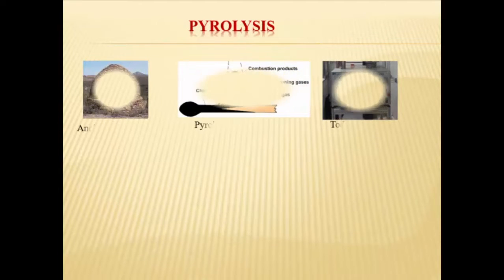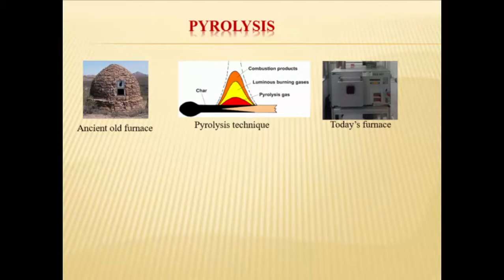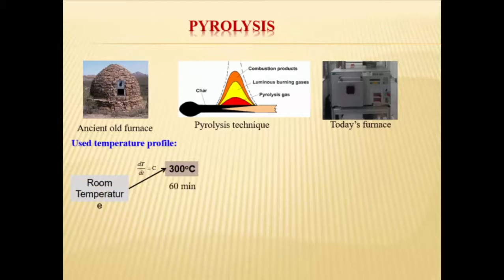Now this pyrolysis process is not new. It comes from the very ancient age, and people have used this kind of furnace to make charcoal and all these things. And nowadays it is available in a very sophisticated manner.